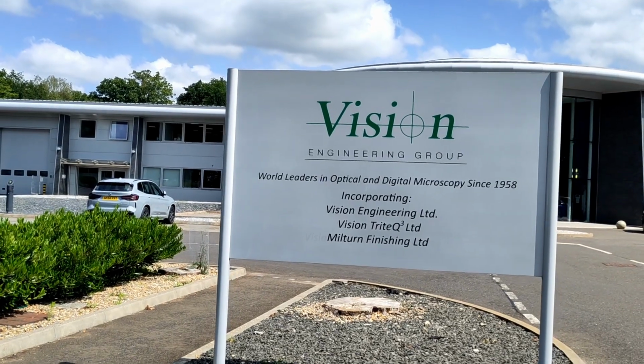I'm visiting Sanderson. I'm International Product Manager for Vision Engineering. Vision Engineering are a microscope company, essentially. We make small things look bigger. We do that for a lot of industries.